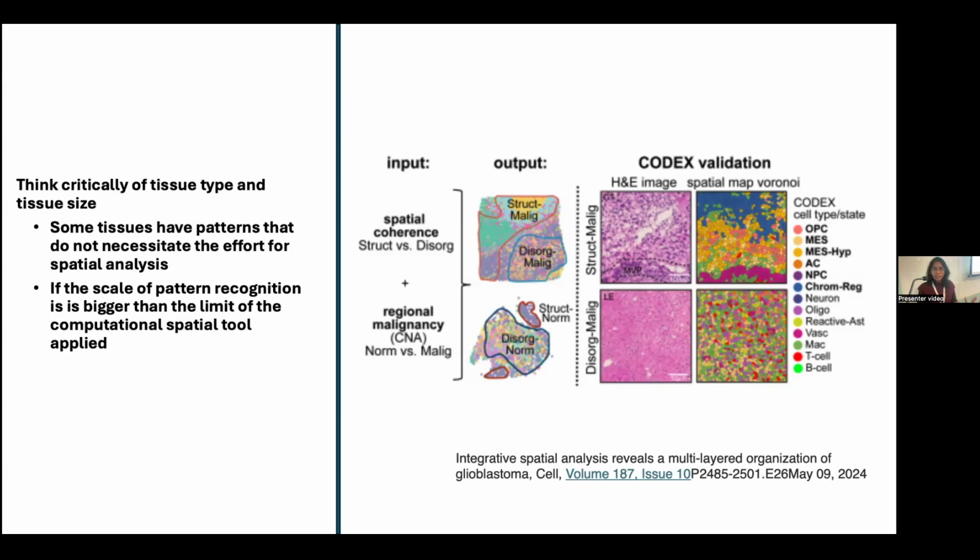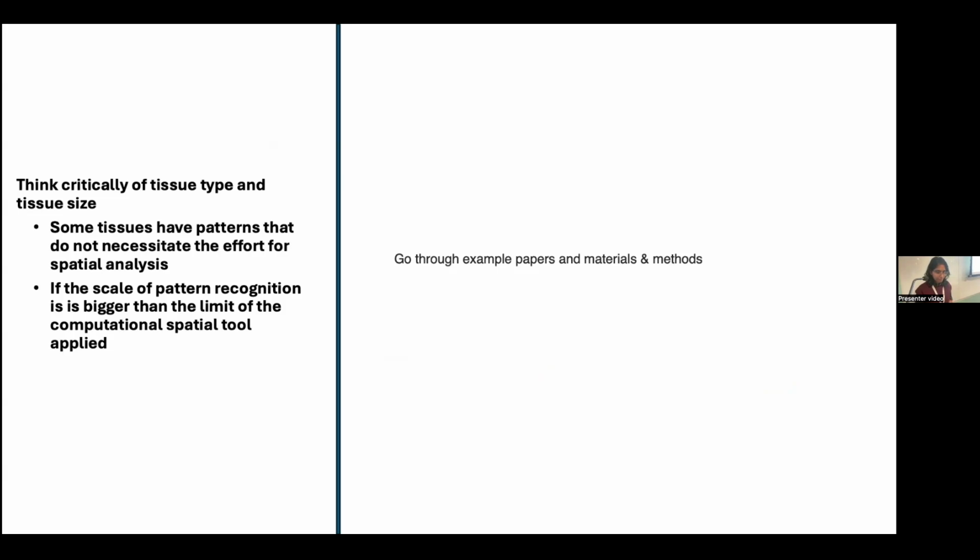They look at your whole data set and try to understand what the variation is. If you have a small area, it's not going to give you that much spatial pattern variance, and you won't be able to pick it up. So this is a good example of that.